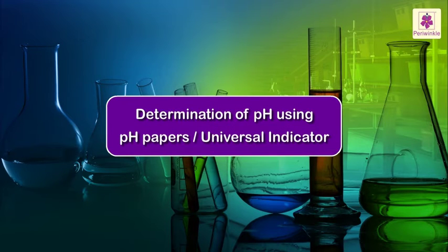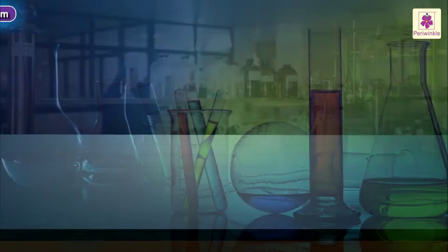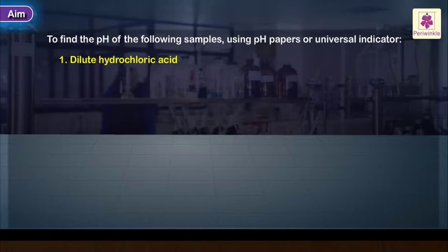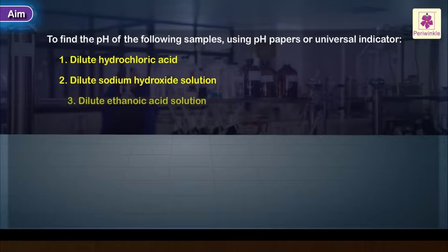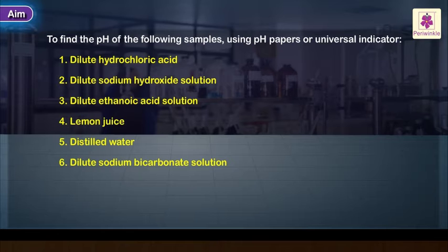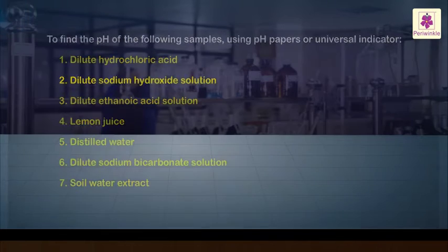The determination of pH using pH papers or universal indicator. The aim is to find the pH of the following samples: one, dilute hydrochloric acid; two, dilute sodium hydroxide solution; three, dilute ethanoic acid solution; four, lemon juice; five, distilled water; six, dilute sodium bicarbonate solution; seven, soil water extract.